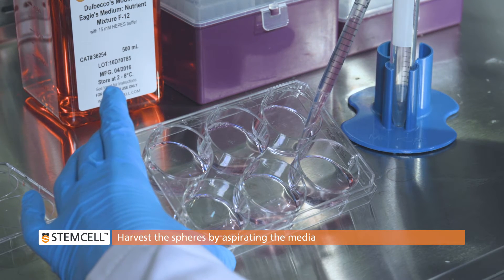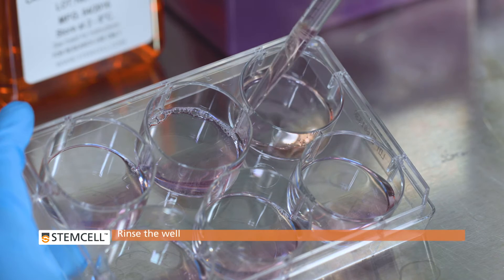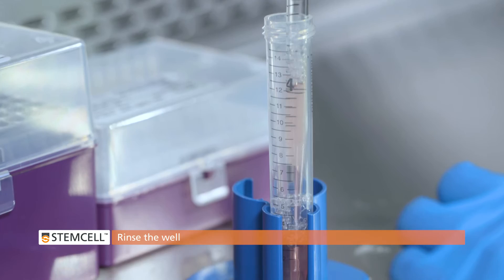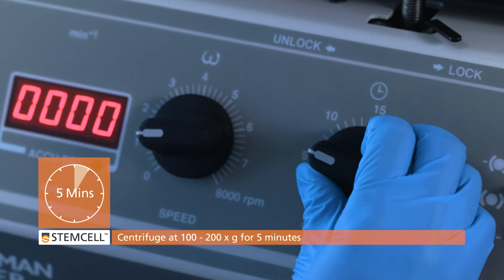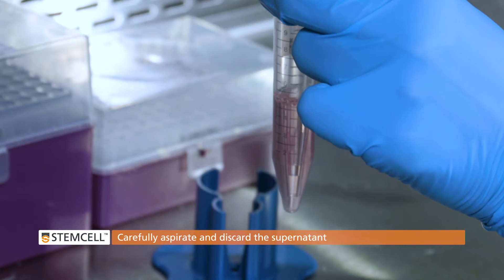Harvest the spheroid culture by aspirating the media and rinsing the well. Centrifuge at low speed, approximately 100 to 200 times G for 5 minutes. Carefully aspirate and discard the supernatant.